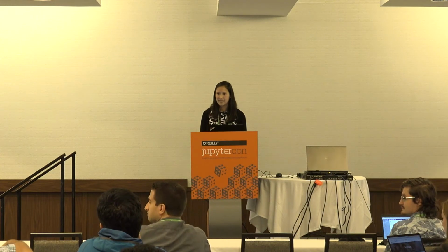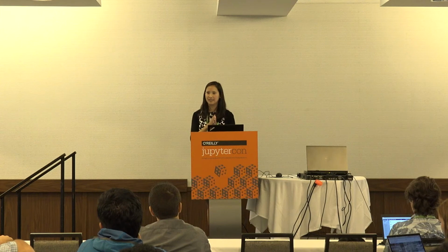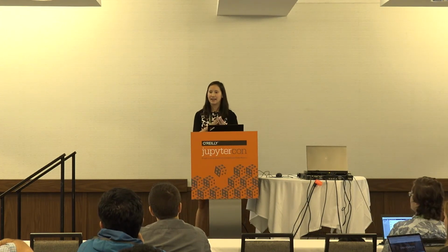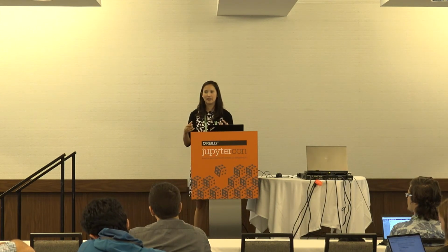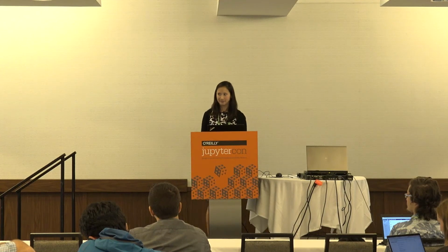Yes? It came down to actually controlling the robot. How was that connection made? Yeah, so the plan that I showed you in the beginning, I don't remember what format it is, maybe a CSV, has this is my destination plate, this is my destination well, this is my source plate, this is my source well, and this is my volume. There's automation software that takes in that template and then sends it off to the robot to do the work.